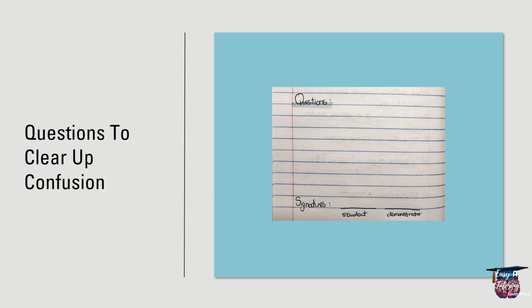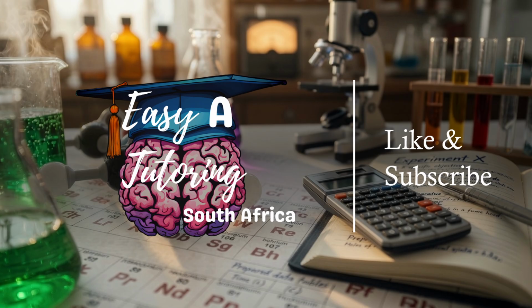Finally, I like to have a little questions section, so if there was anything that I found confusing or unclear at any point during my preparation, I would put them down here, because you never know if you are going to remember any questions that you had when you were preparing by the time that you see the person that you can ask. Then you add signatures if that is necessary, and that is your lab book.